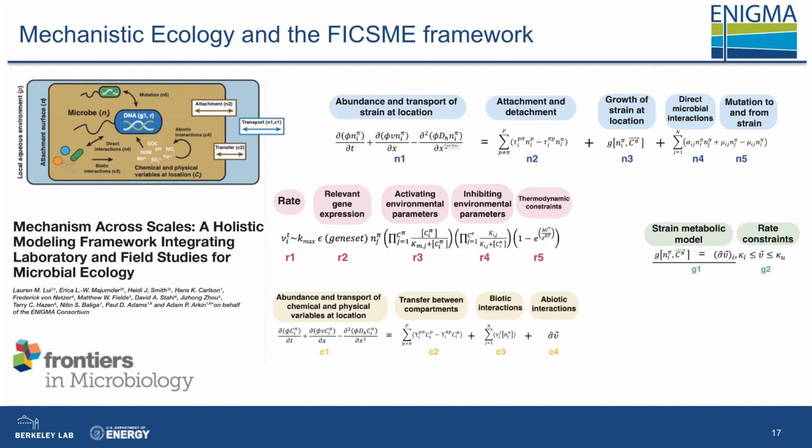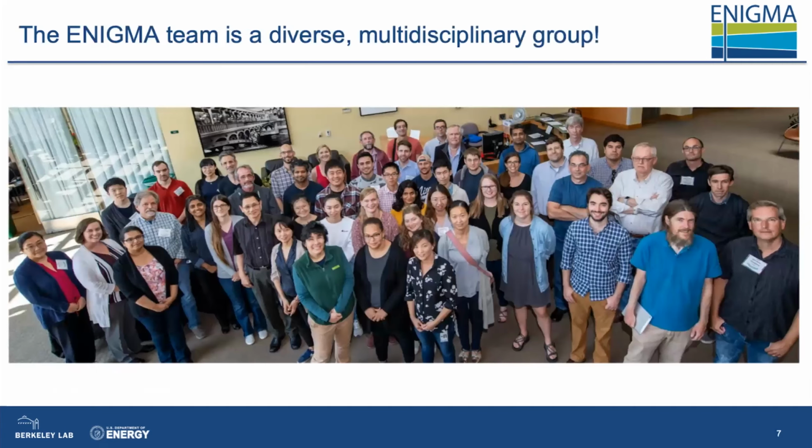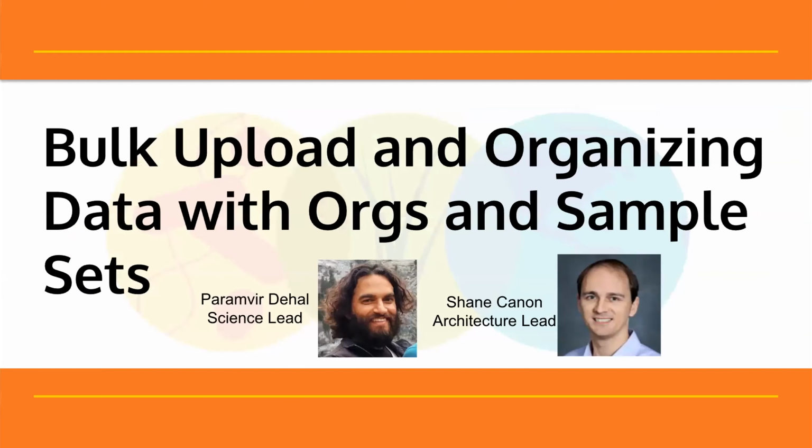And we've been working really hard with the KBase team, given that I have some privilege there, to help us get that job done. Luckily, a lot of the other community members face other jobs, and so they've added things to the system that make our job much easier. Now, Enigma is a very large multidisciplinary group, and this is emblematic. One of the biggest complaints of new people joining the program was they couldn't find where our data and our analyses were. Now they don't worry about that. They can go to KBase.